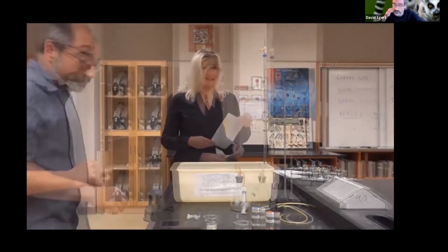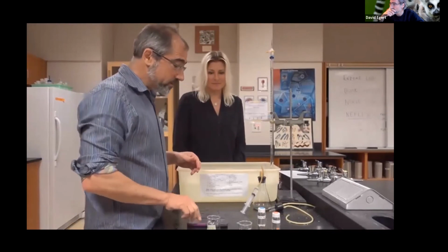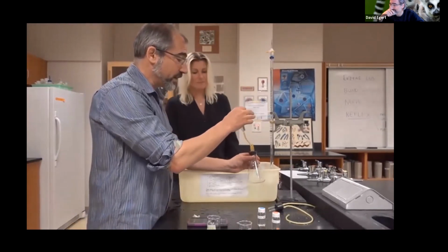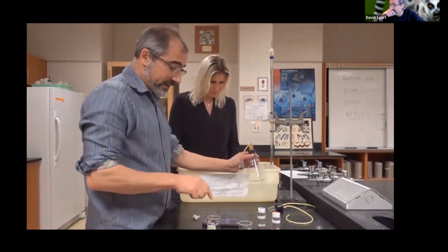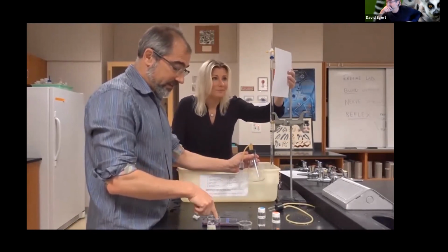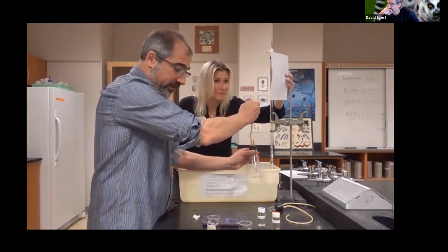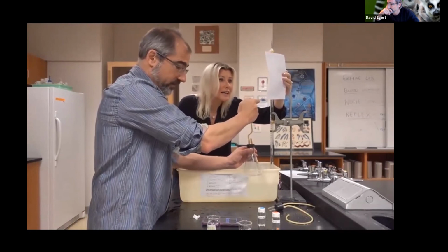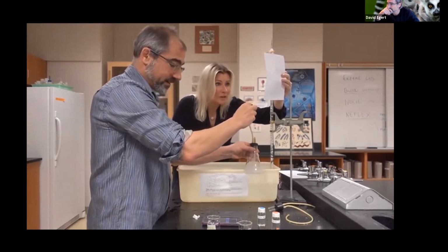So here we go. All right, we are good to go. I've got my timer ready to start. I've got my reaction vessel with my substrate and my enzyme. And I'm going to hit start and make sure I get all of it in here. Read. 49.5. Read. 46.3.